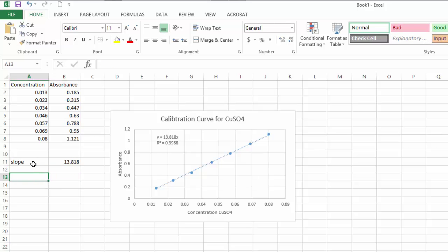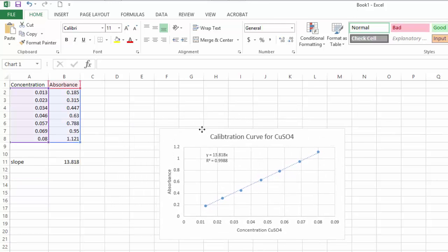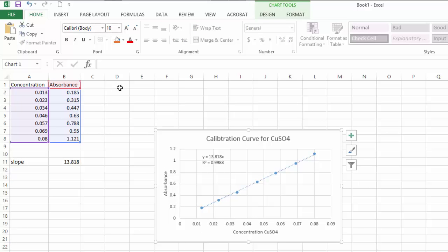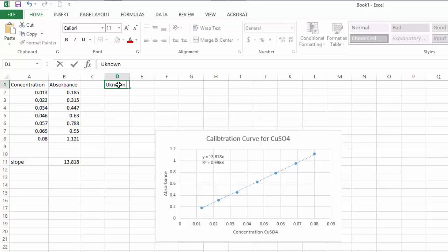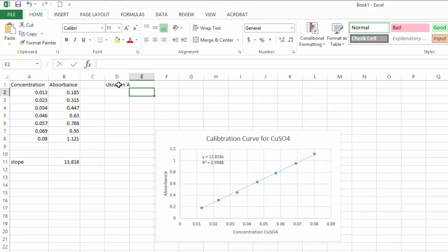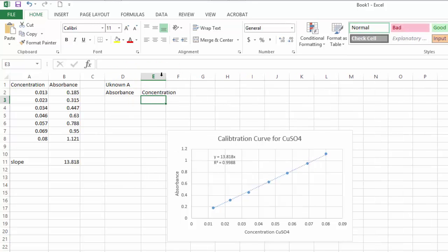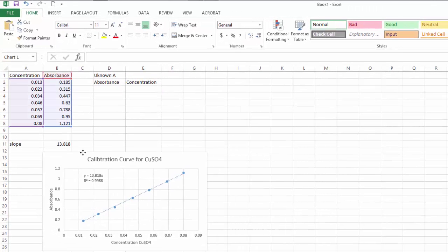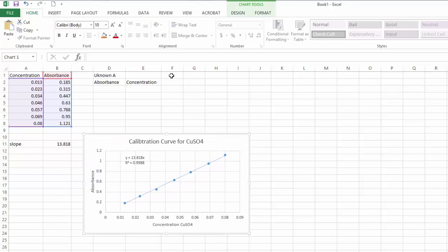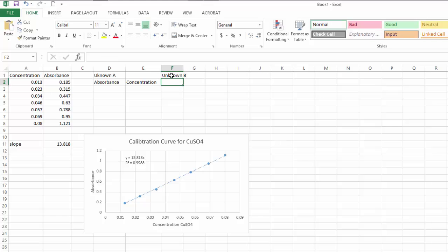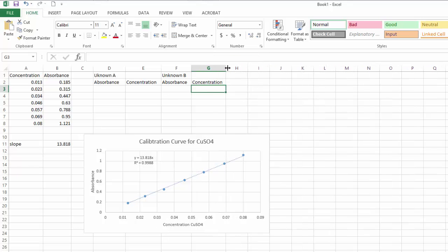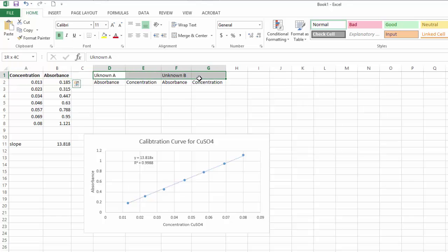Now let's say I have my unknown absorbances. I'll set up columns for Unknown A with absorbance and concentration, and Unknown B with absorbance and concentration. I'll bold those headers so I know they're labels and they're easier to see.